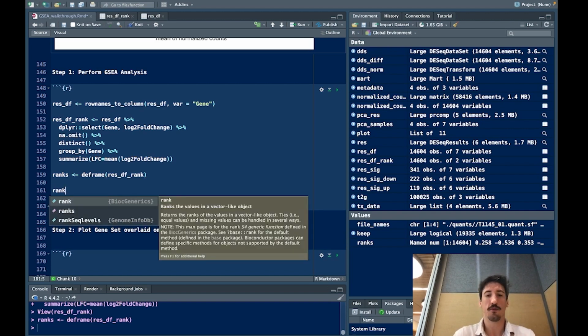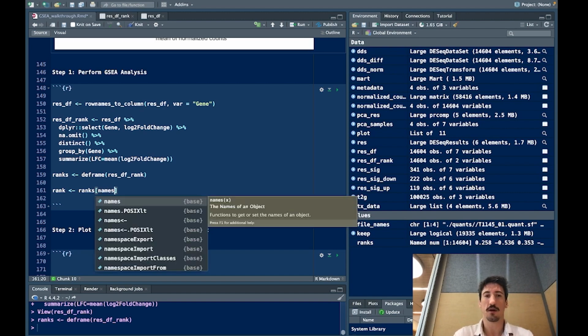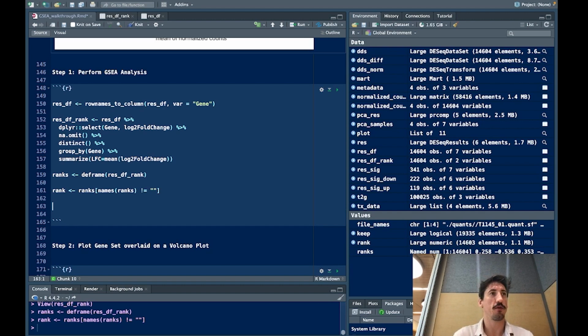And then lastly, we're just going to remove any rows that did not have an associated gene ID. Some Ensembl gene IDs don't have a normal name per se, so those aren't going to get assigned a name. That's okay, we'll just filter those out. They typically are not very important genes anyway. As we can see, it only filtered out one line, so not super important.